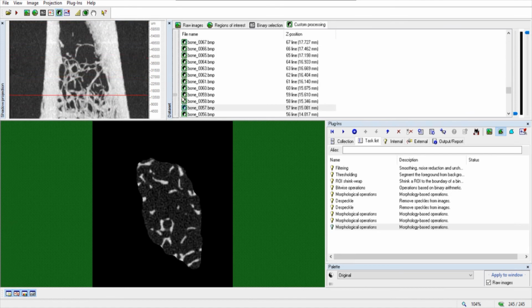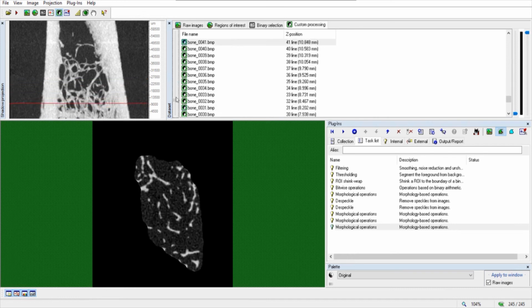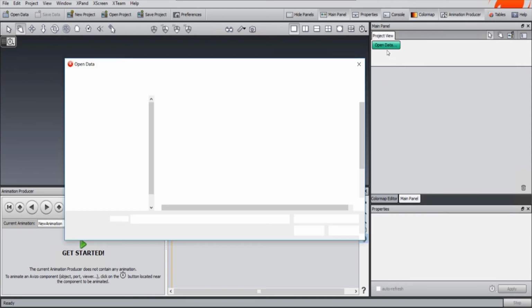So if you want to, you can check it out on my previous video. You will have everything you need to create your own task list. From this one I have saved two data sets separately, separating the trabecular region from the cortical region, and now I'm going to use another software called Avizo to show you how to create a nice presentation for your project.